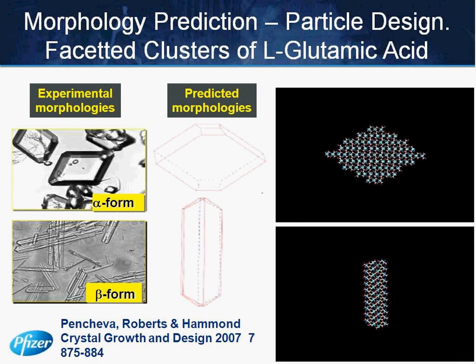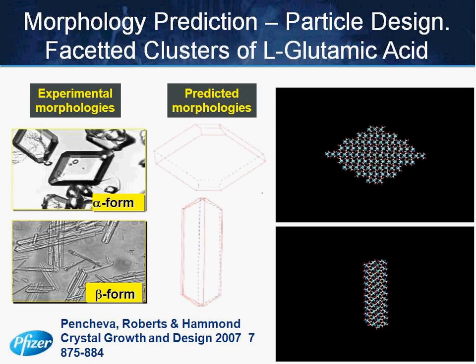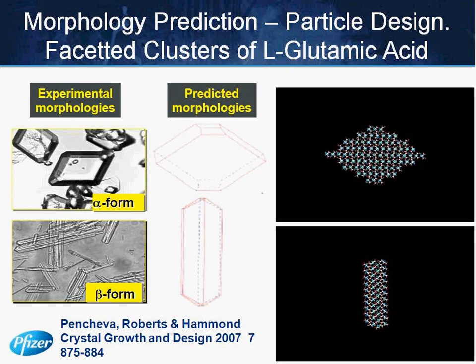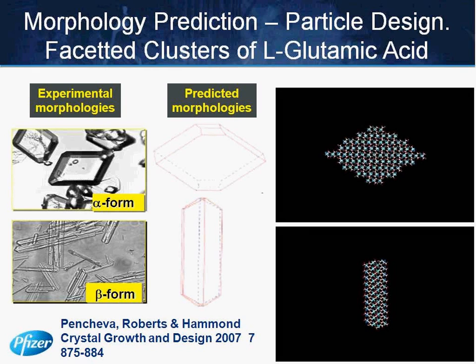What you can do is you can take the crystal structure of both polymorphs. You can predict the external crystal shape based on surface energies and attachment energies. You can actually then look at the chemistry pointing out of these different crystal surfaces. And you can in fact start to look at the impact of changes to bulk to surface ratios and understand the impact of those on relative dissolution rates. So really this journey now, out from beyond the chemistry to the surfaces and how the API interacts with its environment and with other parts of the product, is a really important part of the journey we're on in terms of designing products in a quality by design philosophy.